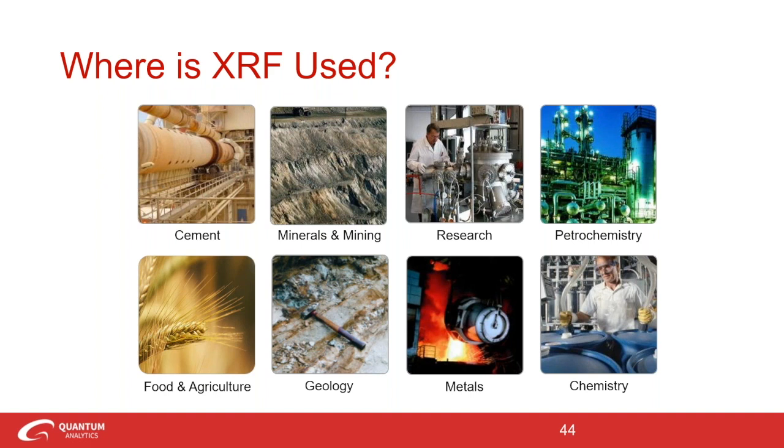For polymers, you'll see it in plastics, and for doing consumer good inspection, like in RoHS analysis. You'll see it in the analysis of pigments of these polymers, the additives in these polymers, and so on and so on. Like uses in agriculture and glass and ceramics. I mean, it's all over the place.